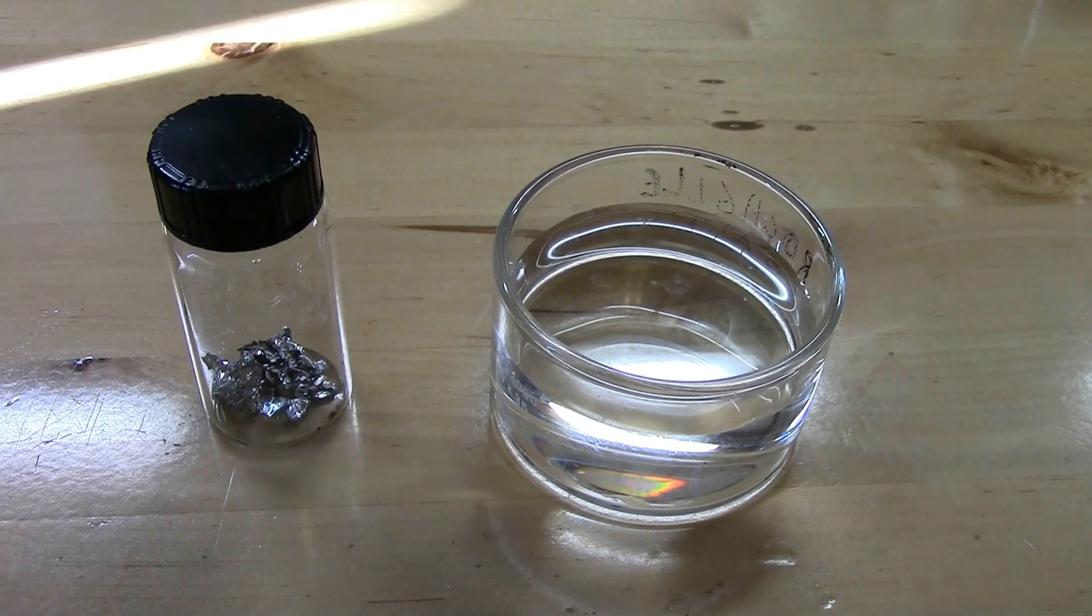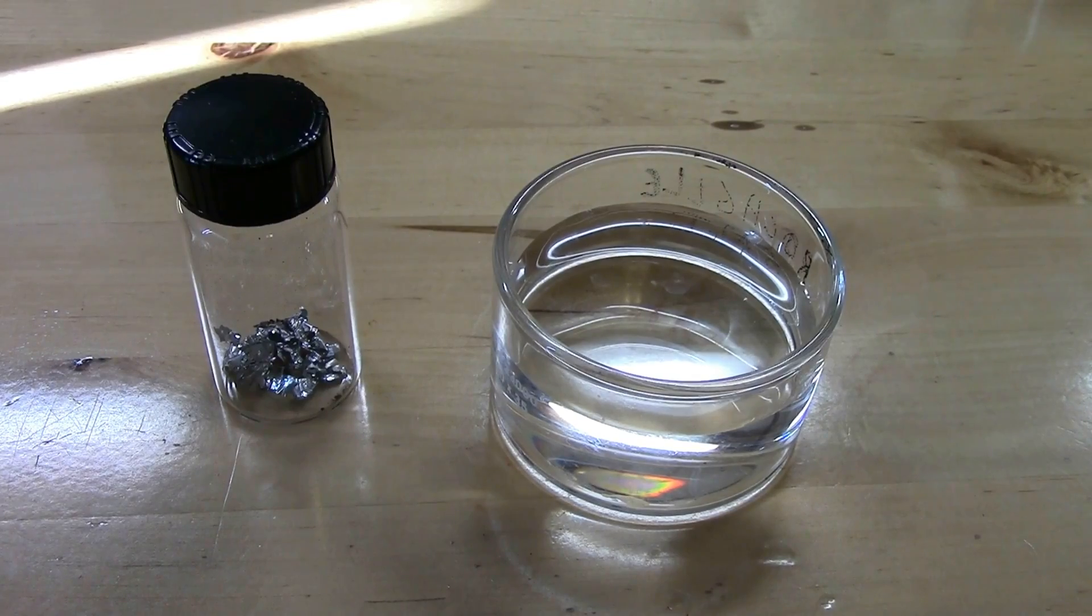Because the way that these batteries work is it's a foil of lithium metal that's separated by a paper separator and then there's an iron sulfide black powder. But the iron sulfide is supported by aluminum. So there's also aluminum foil in there. So I think a lot of the metal that I recovered is actually aluminum. So let's take another look.